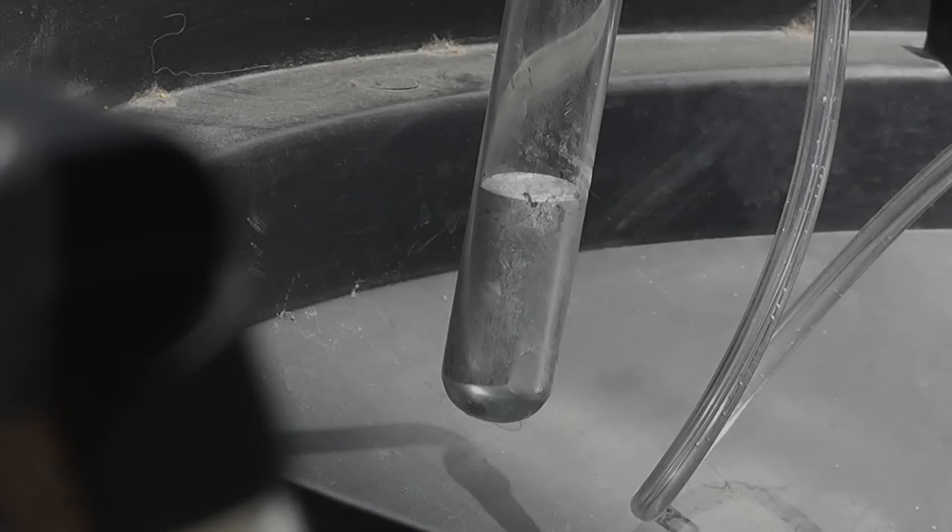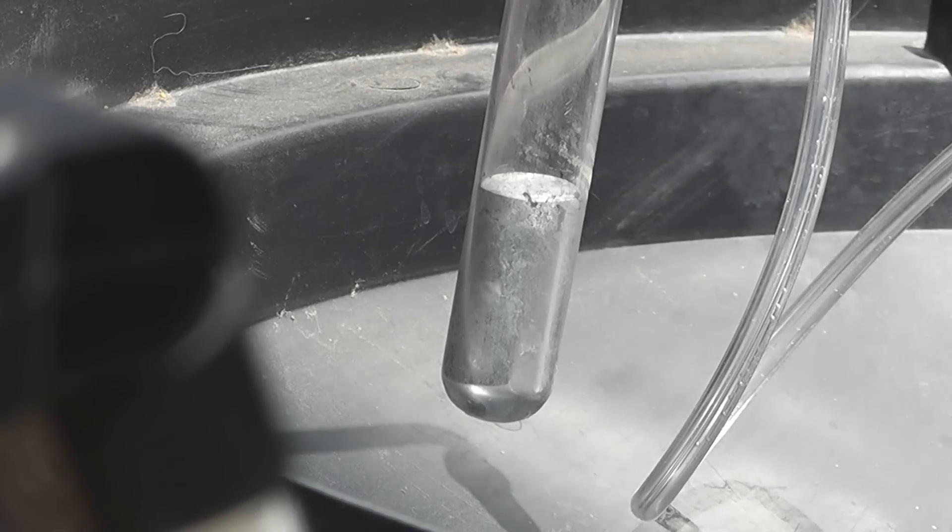Mercury is a hazardous and toxic heavy metal. Do not attempt to repeat this experiment unless you understand the safety precautions needed to safely perform this. Hello everyone, this is Jeff of Tauflatermouse. Today we are going to boil mercury in a test tube. This is very hazardous — don't try it at home.